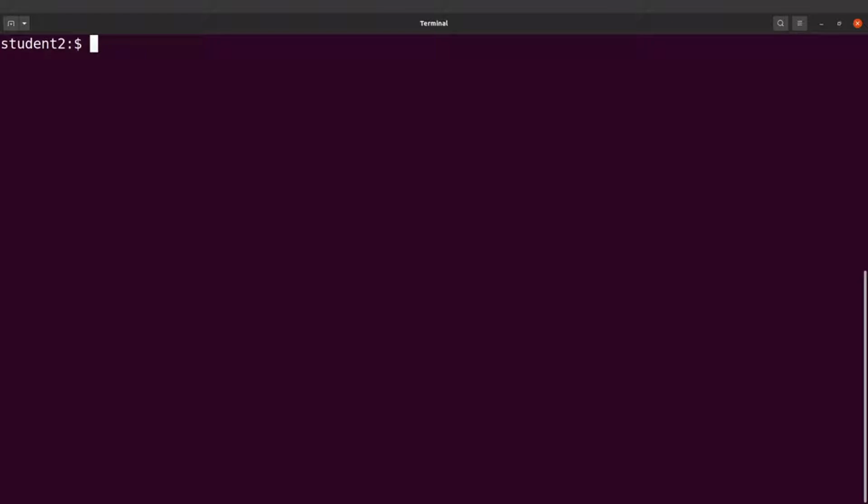After installing Anaconda, what you have to do is to add channels. We are going to add 2 channels, so let me show you how. Say conda config add channels. We will add a first channel, which is bioconda. Let's add a second channel, conda config add channels. The second one is conda-forge.